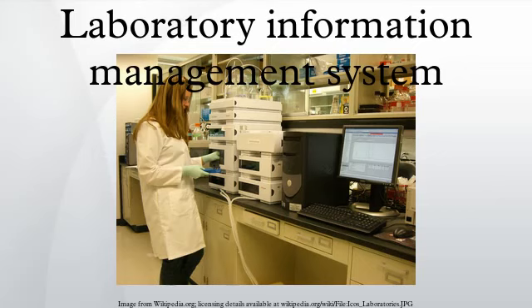History: up until the late 1970s, the management of laboratory samples and the associated analysis and reporting were time-consuming manual processes often riddled with transcription errors. This gave some organizations impetus to streamline the collection of data and how it was reported. Custom in-house solutions were developed by a few individual laboratories, while some enterprising entities at the same time sought to develop a more commercial reporting solution in the form of special instrument-based systems.